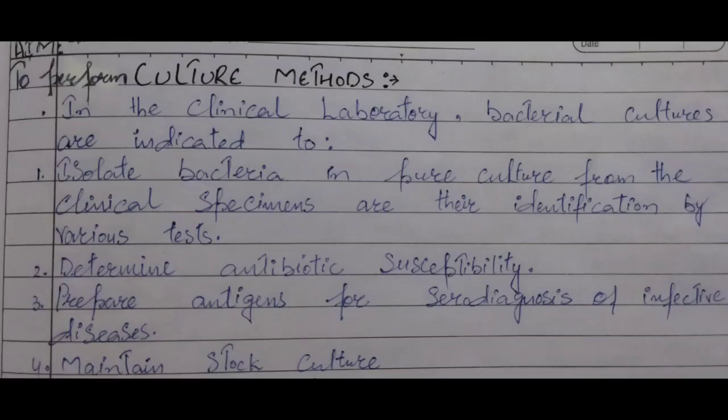आज हम माइक्रोबायोलॉजी के प्रैक्टिकल पार्ट का टॉपिक देखेंगे, कल्चर मेथड्स। In the clinical laboratory, bacterial cultures are indicated to isolate bacteria in pure culture from the clinical specimen, their identification by various tests, determining antibiotic susceptibility, prepare antigens for serodiagnosis of infectious disease, maintain stock culture.